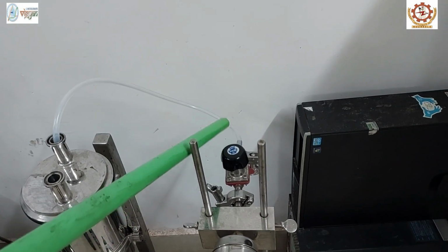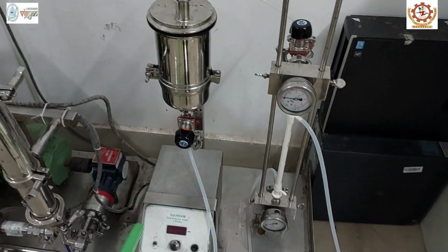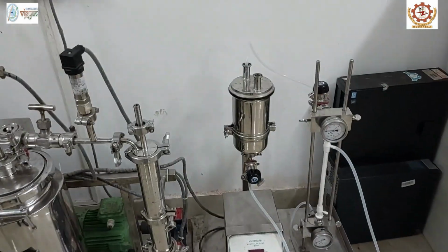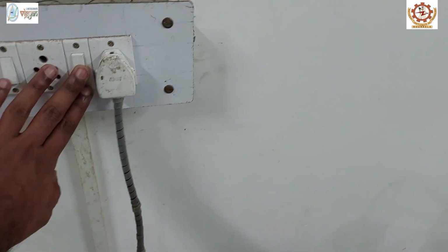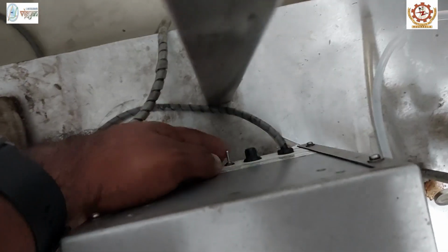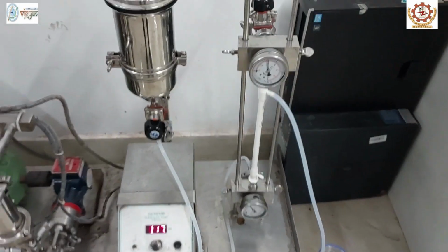Here the retentate will be recirculated back to the feed tank so that it will again pass through the membrane for further filtration. This is how a membrane filtration unit works. When we switch on the main power plug and when we switch on the peristaltic pump, the membrane starts functioning.